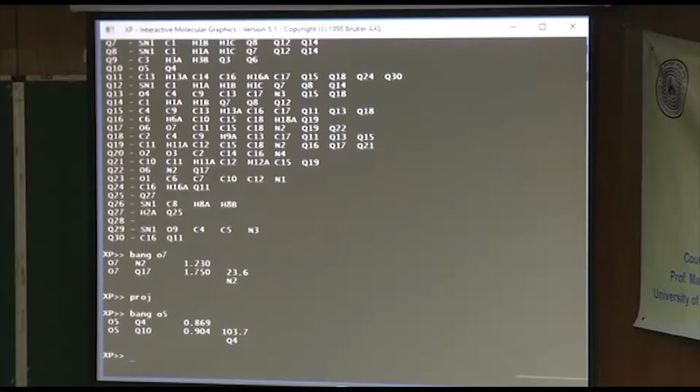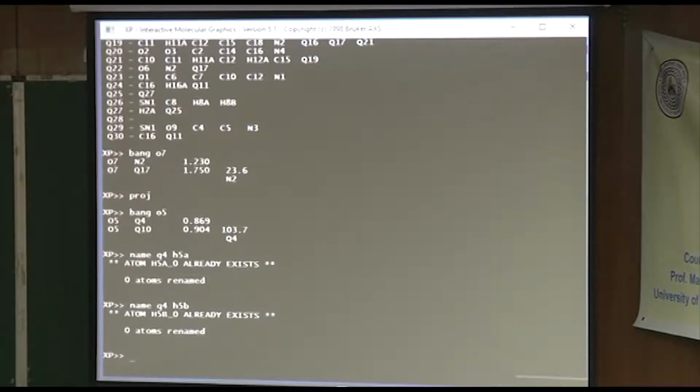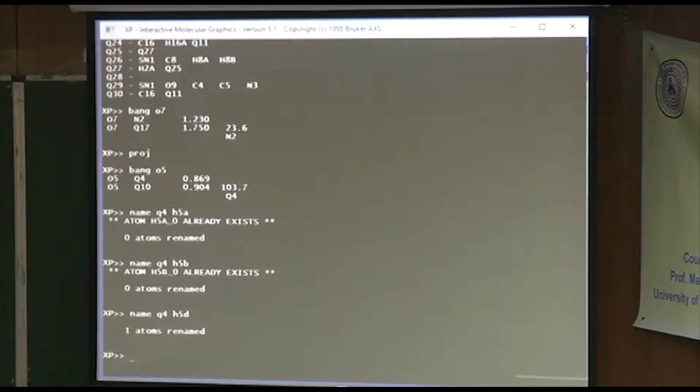So I could just name them, name Q4, H5A. Oh, that already exists. Name Q4, H5B. That also exists. All right, let's just call it D. Okay, that doesn't exist. And Q10, H5E.